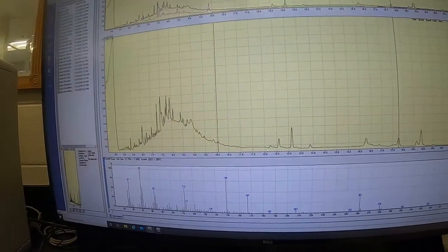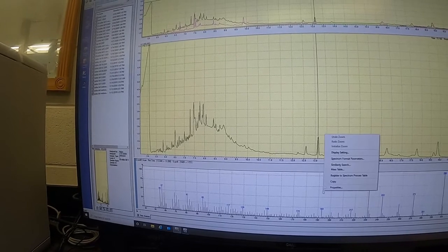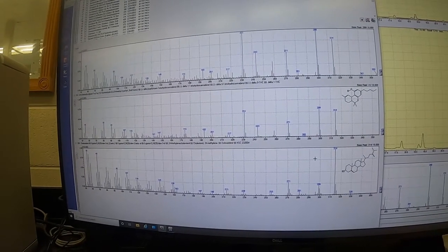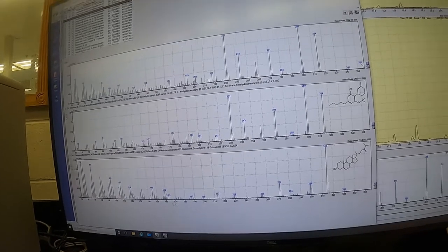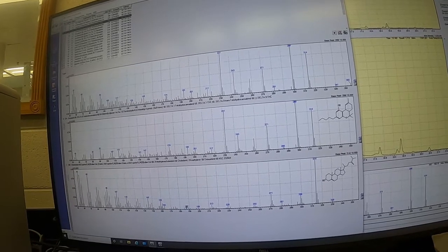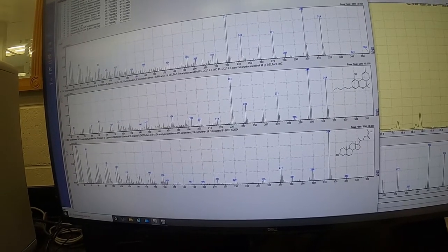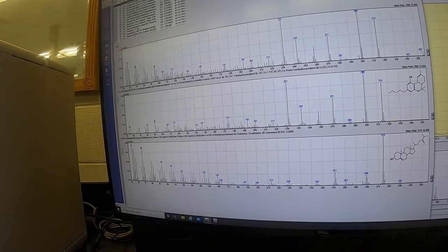So in this sample, we see a lot of things like oils, like oleic acid from French fries. We see a lot of different oils from hand lotions in currency and other normal things you would expect like that. But occasionally, the students were able to find some residues from different illicit drugs, like THC from marijuana or cocaine residue on $20 bills. Overall, it's a very powerful instrument for determining exactly what kinds of compounds you have in an unknown sample.